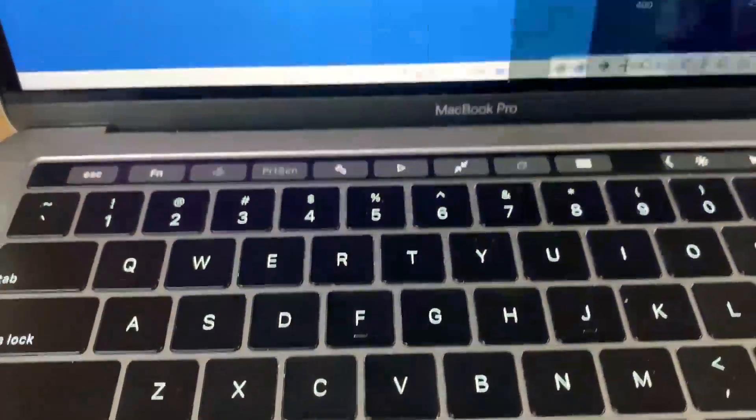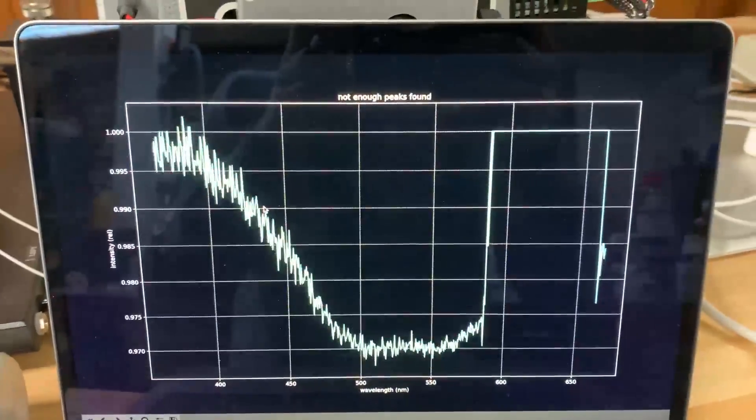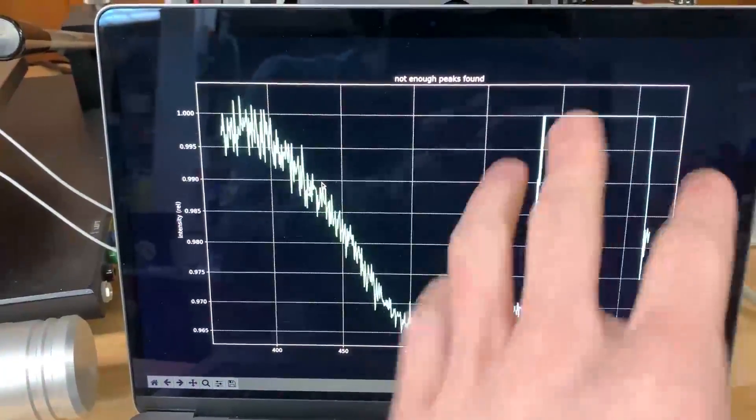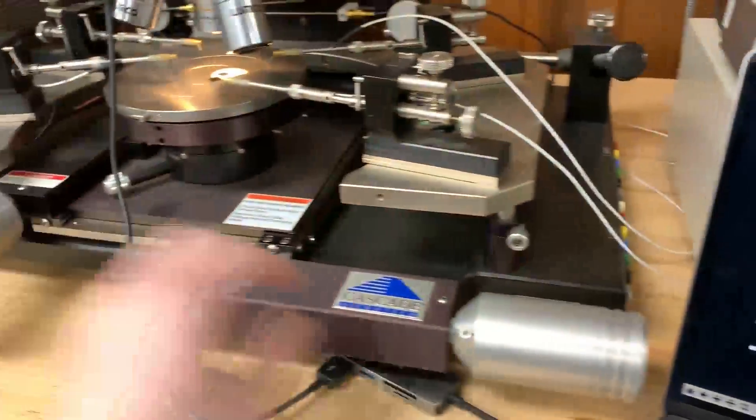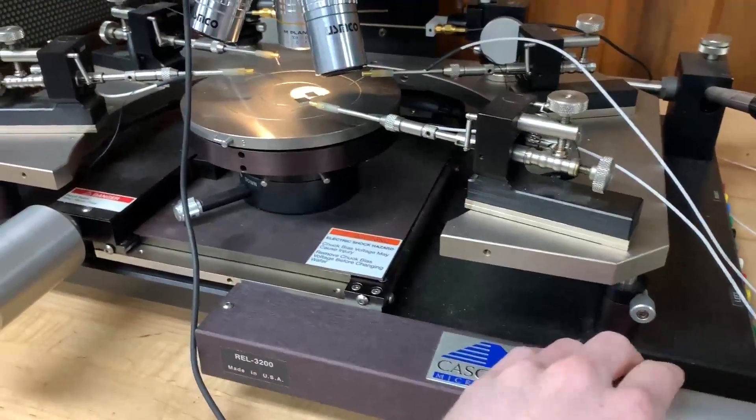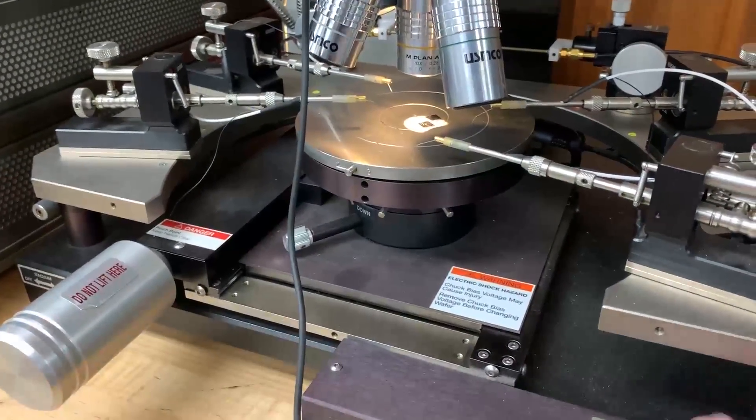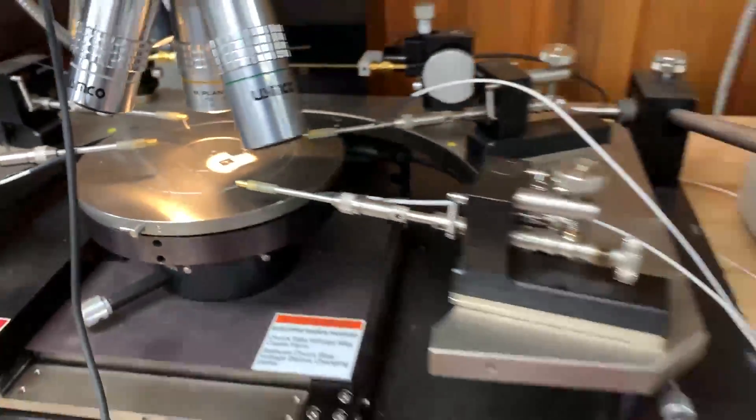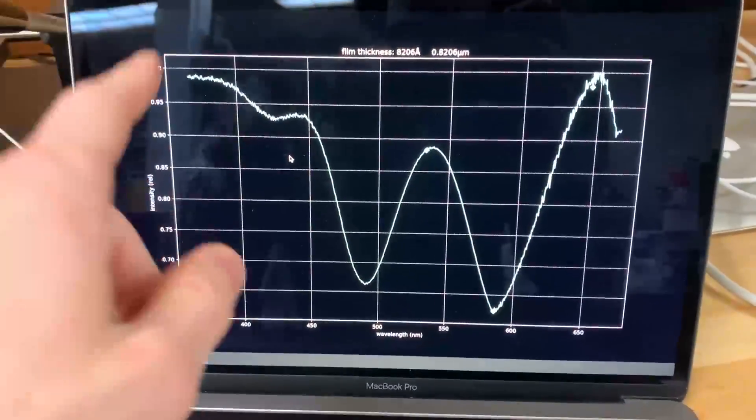And if we go over to a little python script I wrote, right now we're looking at a bare piece of silicon so it's not getting the expected spectrum. But if I just use the xy table here and I move the microscope and position it to look at the sample we want to analyze we come back over here and notice there's a bunch of peaks.